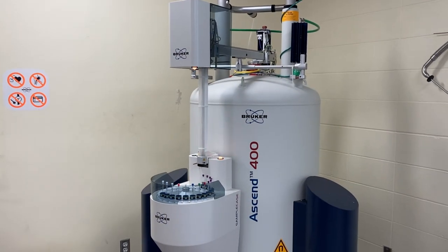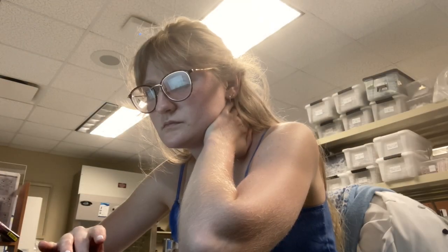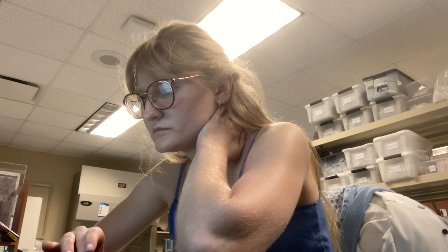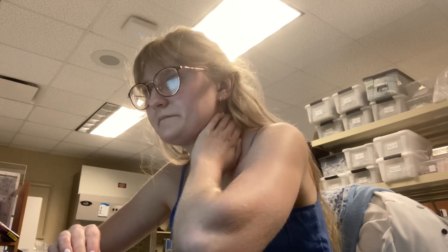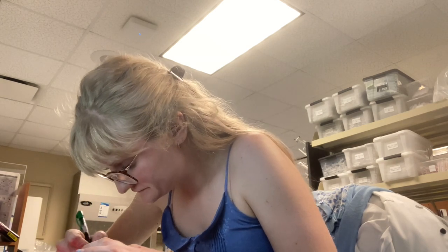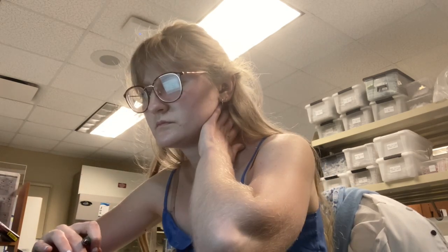Here is our wonderful NMR instrument — props to the Creighton Chemistry Department. After submitting the NMRs, I was looking at all my data and getting really frustrated because I thought I had enough sample in my tubes. It turns out I did not, because every time I opened my file it just showed the peak for the deuterated chloroform. Zooming in, while I did see signal, it was very hard to determine whether that was actually my sample versus noise, which also skews the integrations — how many protons per peak — based off that one solvent peak. It can make something appear a lot smaller than it actually is. I'm going to have to resubmit those for tomorrow and just add a little bit more of each sample into the tube.